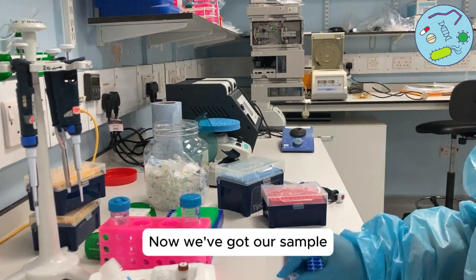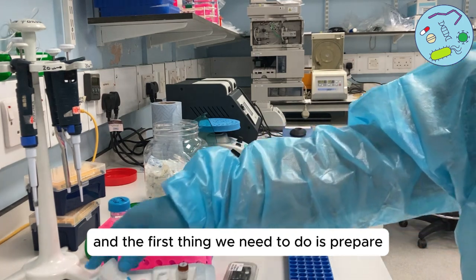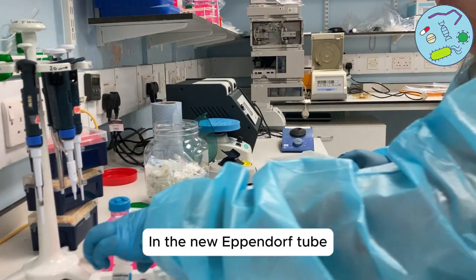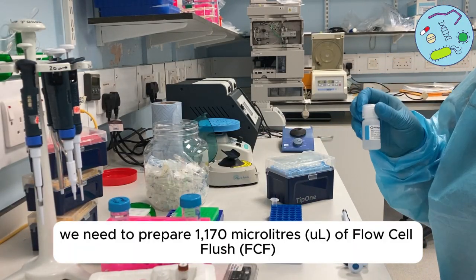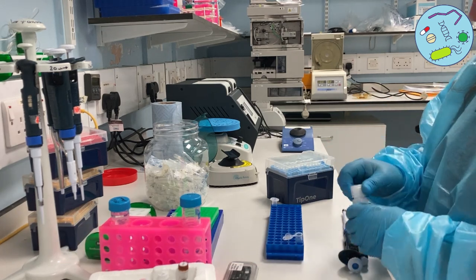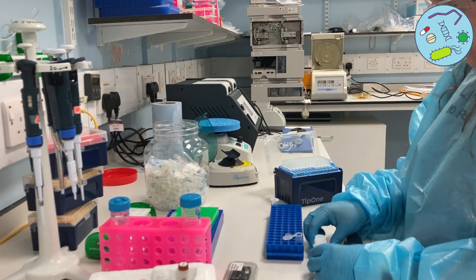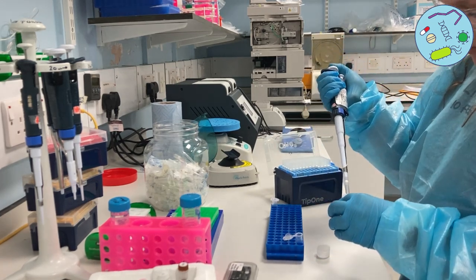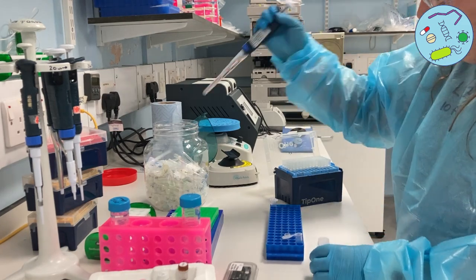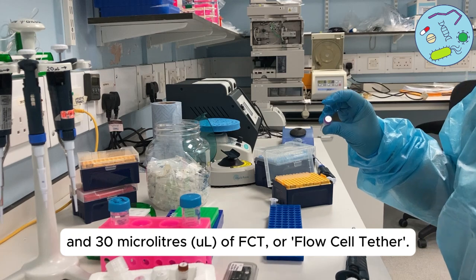Now we've got our sample, it's time to prepare for loading the flow cell. The first thing we need to do is prepare the flush buffer. In a new Eppendorf tube we need to prepare 1,170 microliters of flow cell flush and 30 microliters of FCT, or flow cell tether.